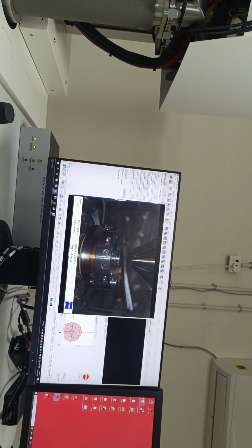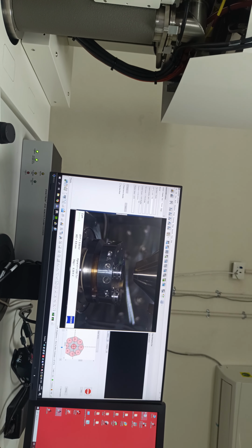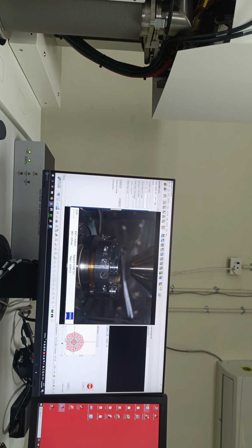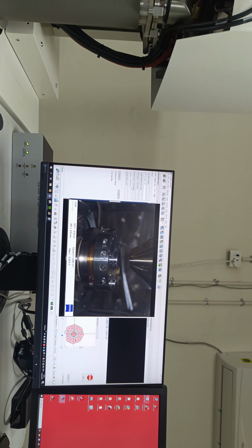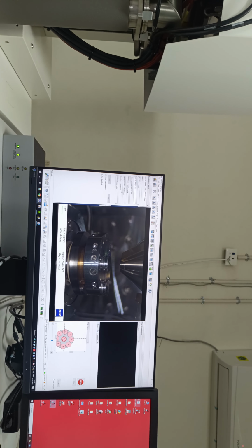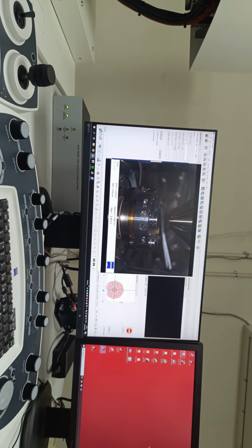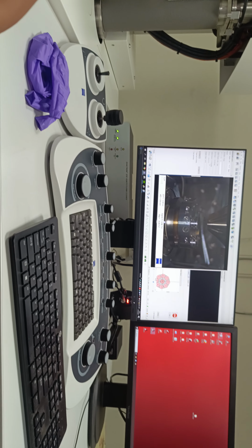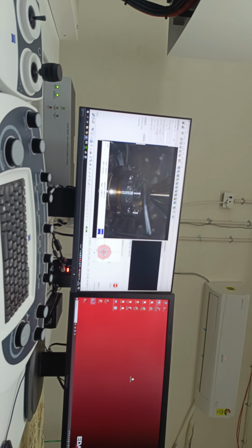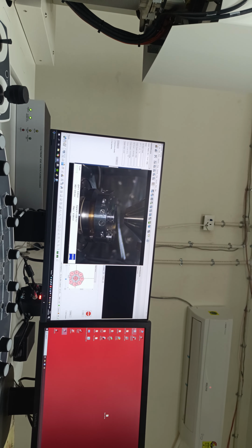Our normal secondary electron detector will not work here. Why will it not? Because there is a lot of nitrogen, and the secondary electron signal coming to the system cannot be detected by our normal detector. So another separate detector is provided, and the BSD detector we can use in both VP and HV modes. You can also ask questions if you feel like. Okay, don't worry.